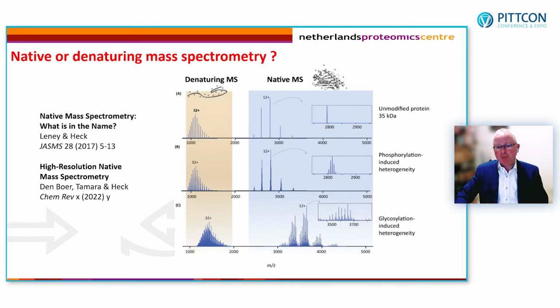And what we have been working on is to see if we can actually keep the protein more in its native state. Now, we do this by not using the organic element, also by keeping the pH at about 7. And if we do that, we can actually spray these proteins directly in the mass spectrometer.